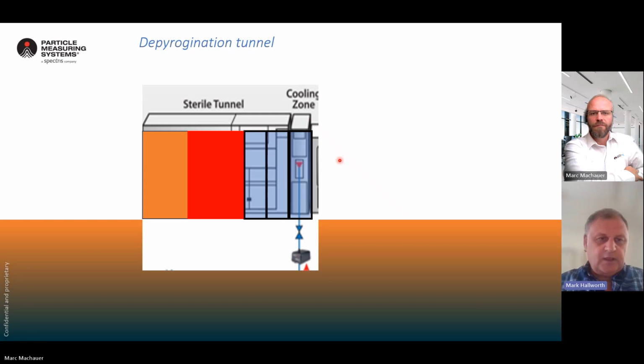The 0.5 will demonstrate the cleanliness of the area, and the 5 micron will give you that first indicator that macroparticles exist, and it's those macroparticles that have a higher potential to be a viable risk. There are a lot of ifs, ors, and buts in that little greater than 5 micron; the 10 to 20 microns are the ones that have been demonstrated to be the free floating viables within clean room air.